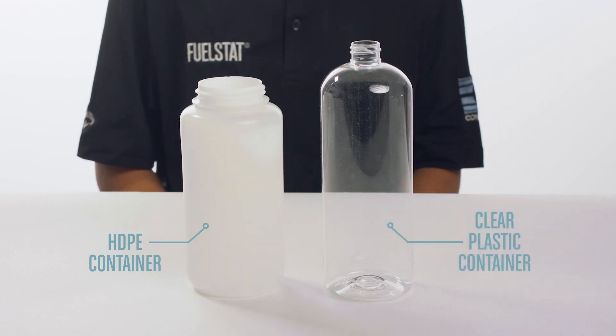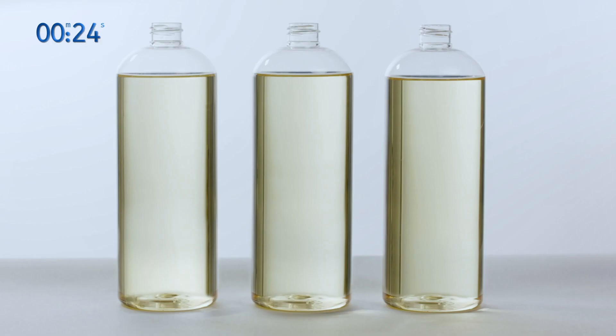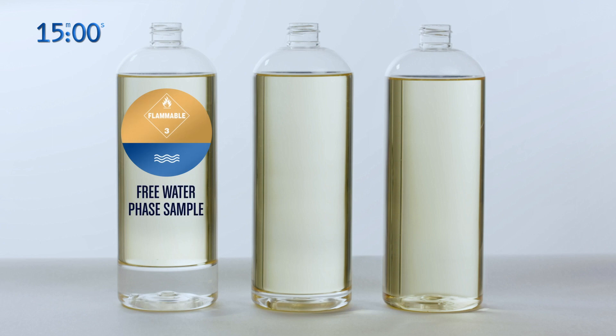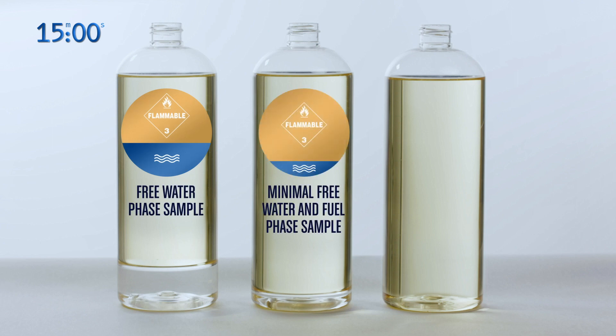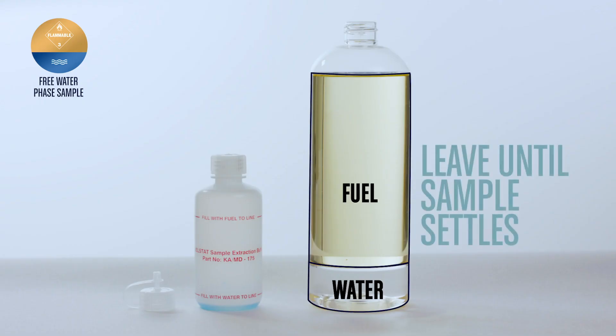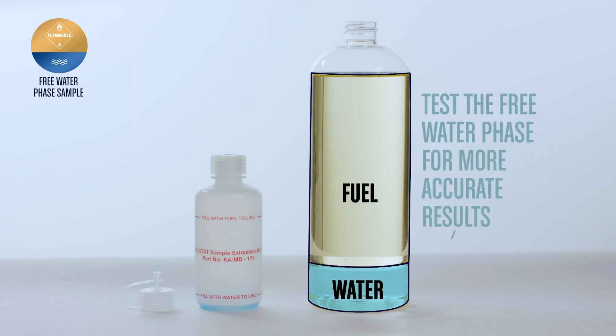To clearly show each step, this video will use clear plastic containers and a fuel substitute. Take a 1 litre sample of fuel, swirl the fuel in the container, then leave the sample to settle for 12 to 15 minutes. The fuel stack test can be conducted with a free water phase sample, minimal free water and fuel phase sample, or fuel phase only sample. It is always advisable to conduct fuel stack tests as soon as the sample has settled, and more accurate results come from testing the free water phase through a generous water sample.